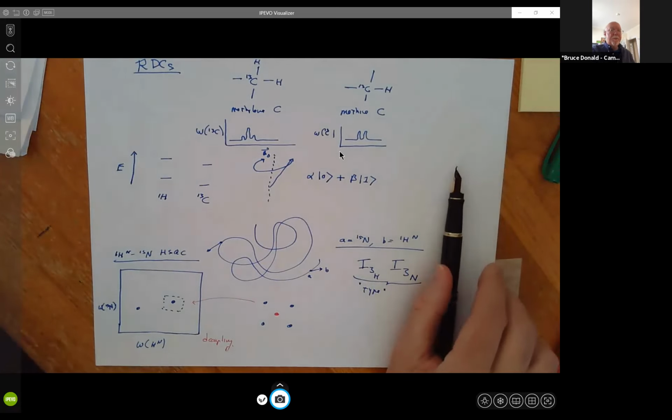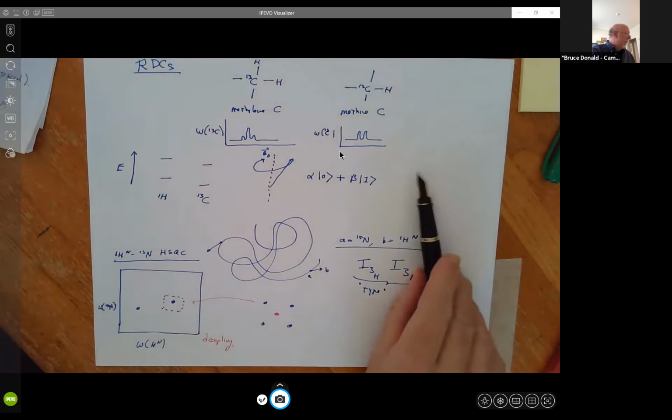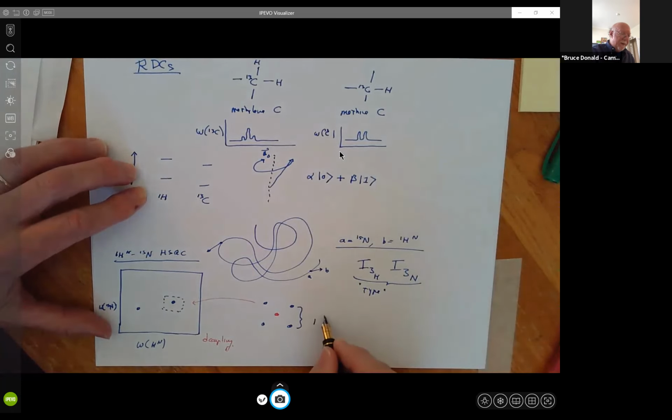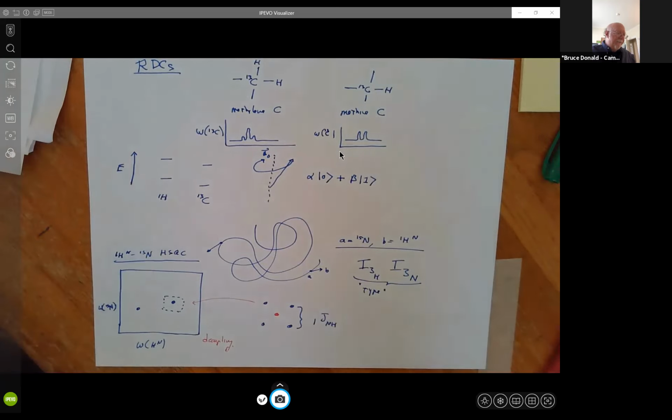And so if I do another experiment with the same type, I'm going to see similar kinds of interactions. And a key thing here is that these differences are called the scalar couplings. This is the 1J NH scalar coupling. So it's a coupling across just one bond vector here from the N15 to the NH. So if we're going to do something to the system, we'll observe those splittings in different experiments. So this is a way of typing the information that we're going to get here.